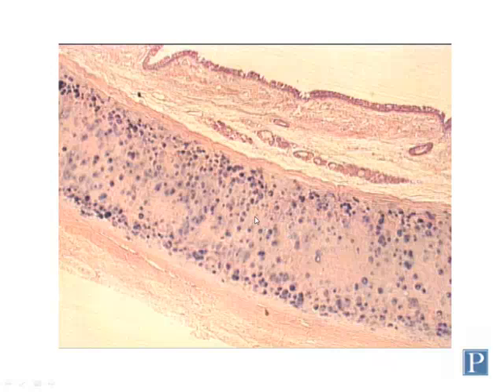This is actually a cartilaginous ring that is found in the trachea that helps to reinforce the walls. That cartilaginous ring is a C-shaped ring composed of hyaline cartilage. Hyaline cartilage is tough and helps to reinforce the walls of the trachea so that when you breathe in, the negative pressure doesn't cause the walls of the trachea to collapse on each other.